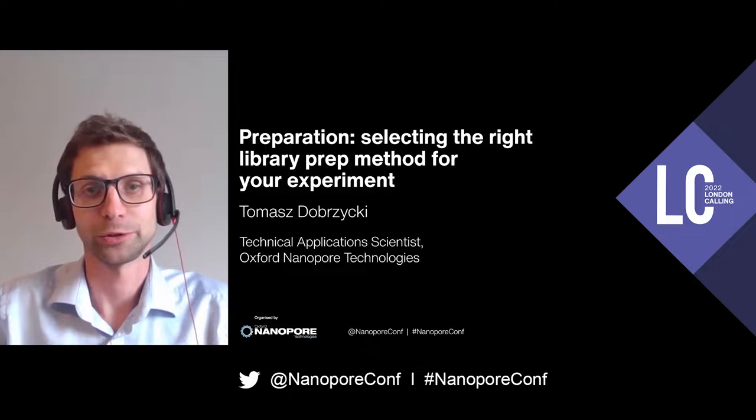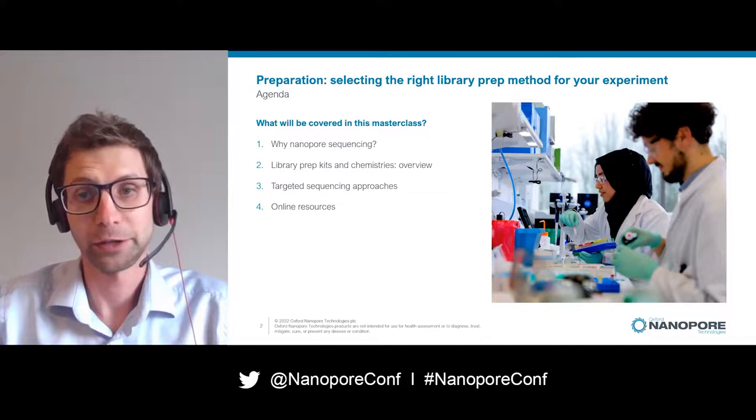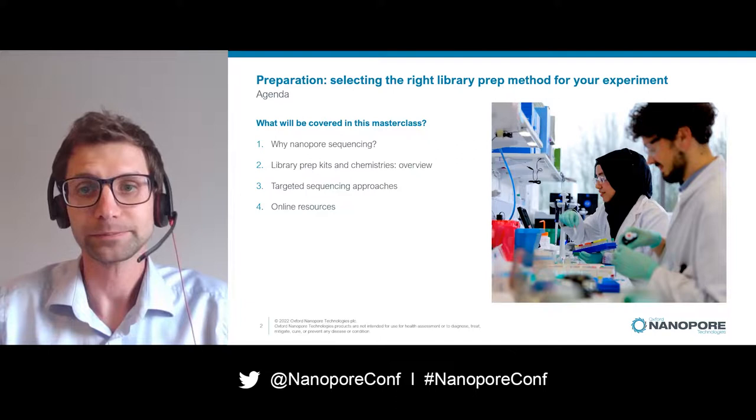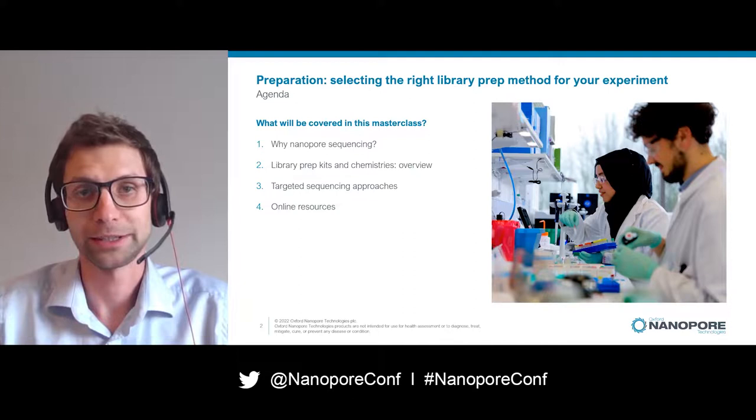I will start with a short introduction to nanopore sequencing and then move on to the kits and available chemistries, further discussing targeted approaches. In the final part of this masterclass, I will cover the resources available that will help you find the protocols and best workflows available for your application. If you'd like to learn more about other aspects of the technology, such as how nanopore sequencing works or how to analyze your data, please refer to the relevant masterclasses.